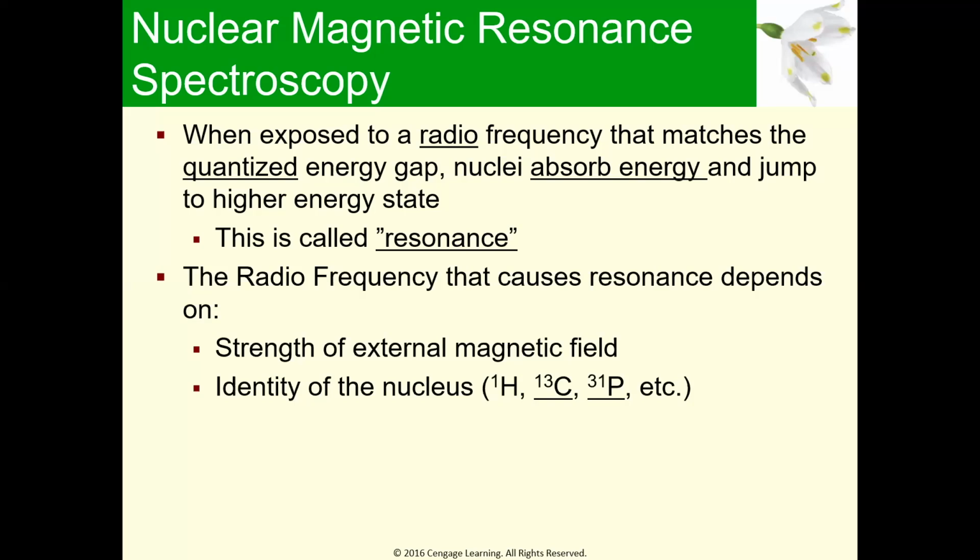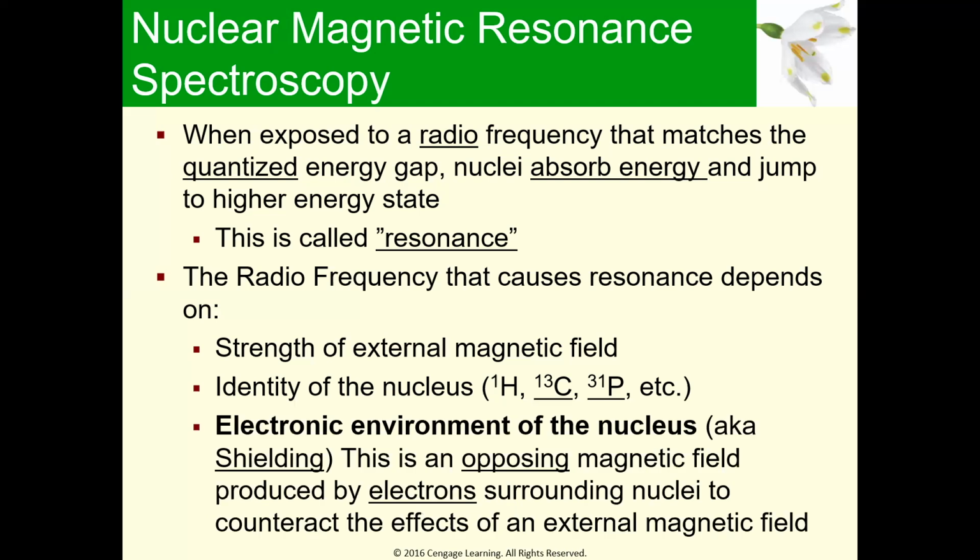This is one thing I will point out, but again, we won't focus on it today: NMR is a particularly powerful analytical technique because it is capable of analyzing lots of different element types. You just have to have a nucleus with an odd number of nucleons in it, an odd number of that sum of neutrons and protons. So things like hydrogen 1, that's an odd number. Carbon 13, phosphorus 31, and there's others. But as I said, today we're going to focus on this.